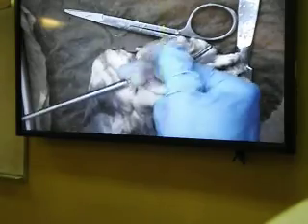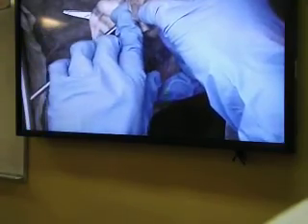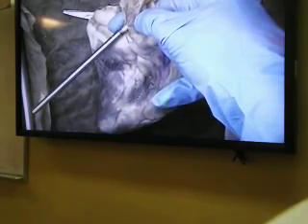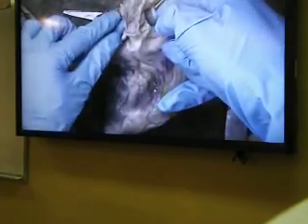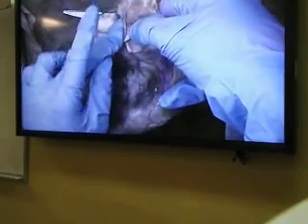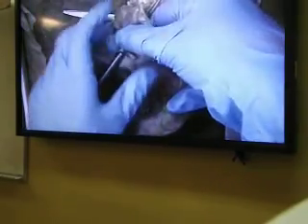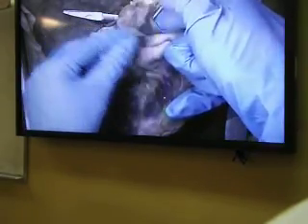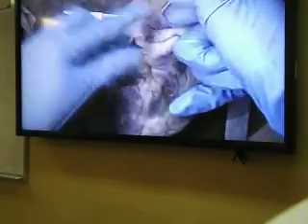We just saw the human heart model, and there is a difference in the position of the inferior vena cava in the human heart. We are a two-legged animal, so our inferior vena cava is attached to the inferior region of the heart, while a sheep is a four-legged animal, so the inferior vena cava has a posterior connection to the heart. Alright? Okay, so that's actually the main difference that you see between the human heart model and this sheep heart. Okay, so this is superior, this is inferior.